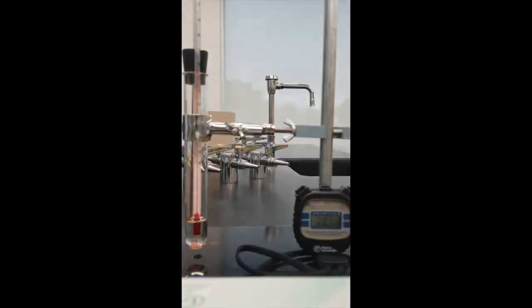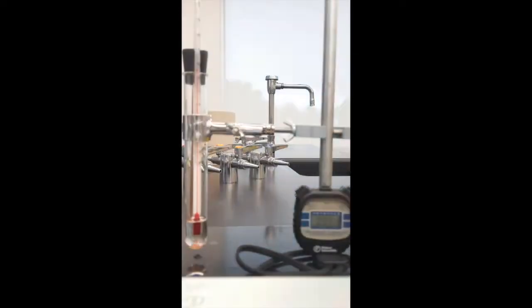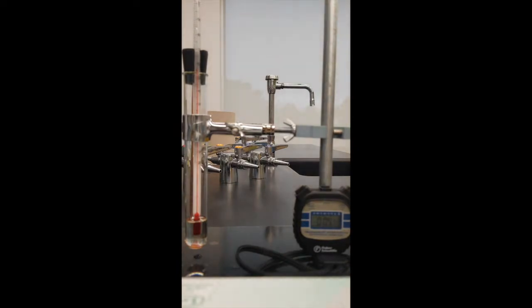Alrighty, here you can see that I have started cooling this down. I've melted the Salol into a liquid. It's a clear colorless liquid, as you can see. It's at about 55 degrees, so maybe a little bit above that, 56, and dropping. Feel free to speed up this video and every minute or so make a temperature reading from the thermometer on the left and plot that data.